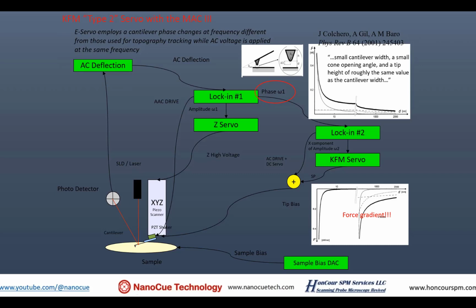Yeah, I did something with gold, and I did not do the KFM because gold does not give you contrast. When you image gold, after about 45 minutes the surface just lost all its atomic steps, and then it started to form a herringbone structure. First you burn the gold with flame, so it's clean. You burn off any contamination. Now you continue imaging, and then gradually it's just changing shape in about an hour.